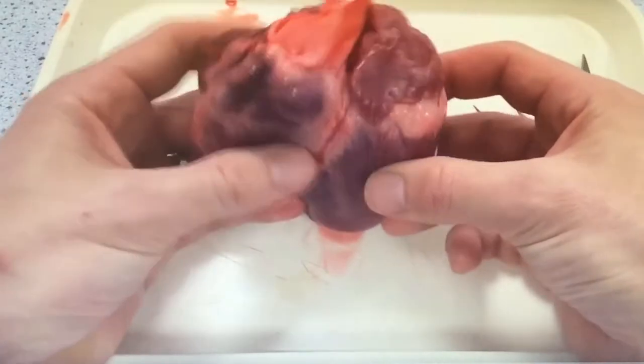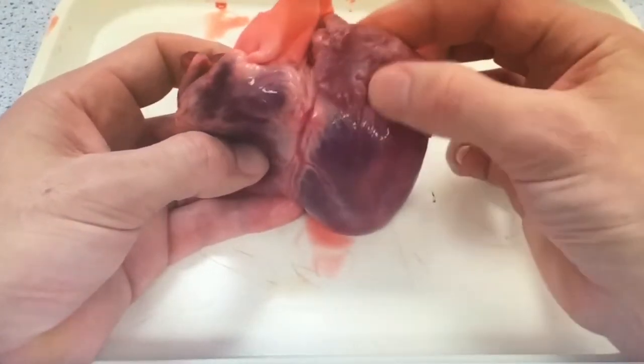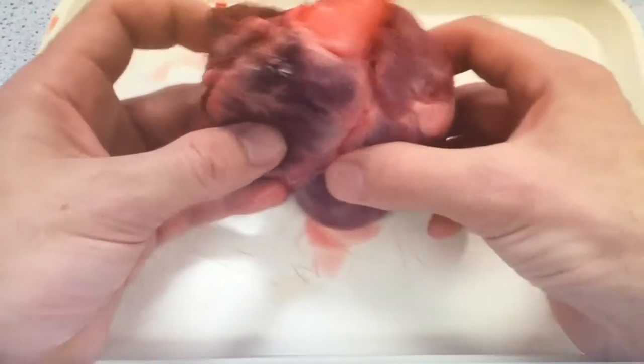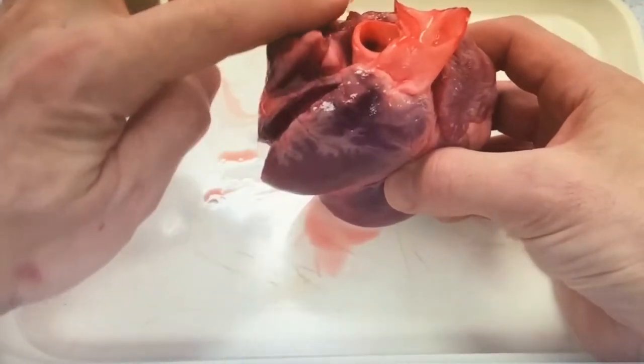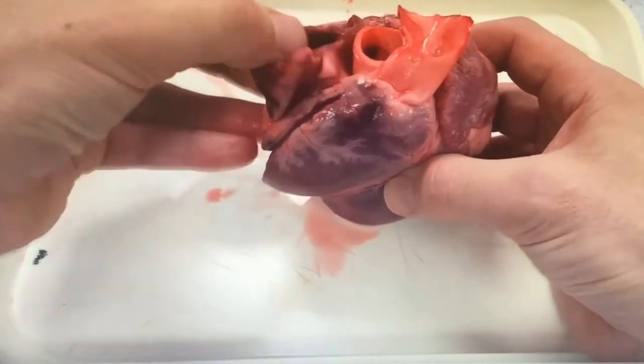What is required for your required practical is for you to know your way around the heart. The atria sit at the top on top of the ventricles. On this heart you can see where the butcher has cut across the top, which might well be the case on your heart, and it opens straight into the atria.